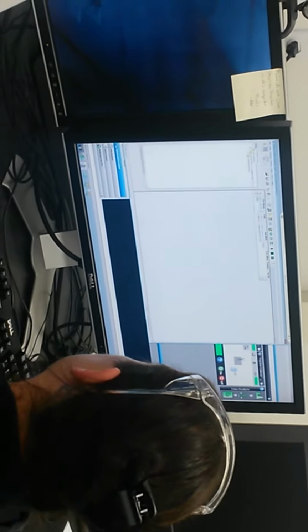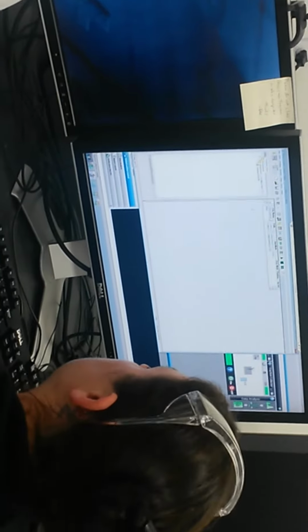Okay. Now do the clean. So click on it. Yeah, the clean. Click on the wrong sample, hit okay. Now do the same thing for the clean. Do it twice. Next thing, right? Good. Now go to your HPLC.